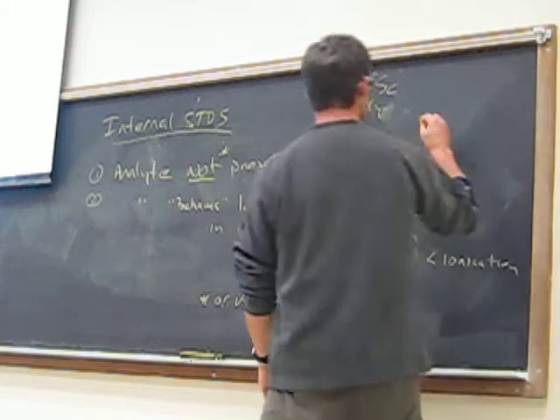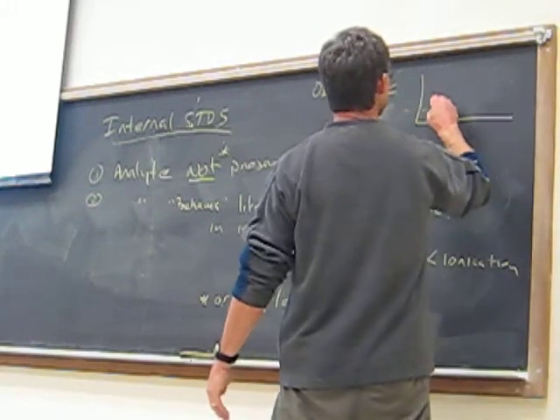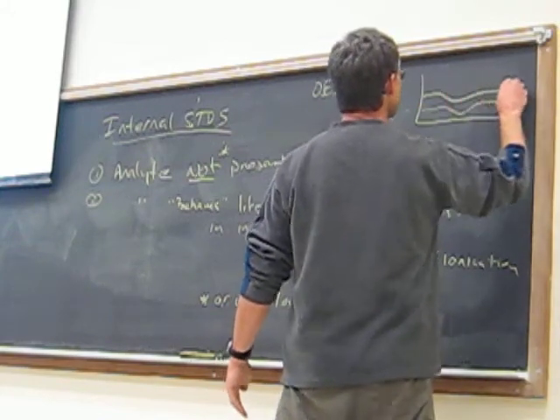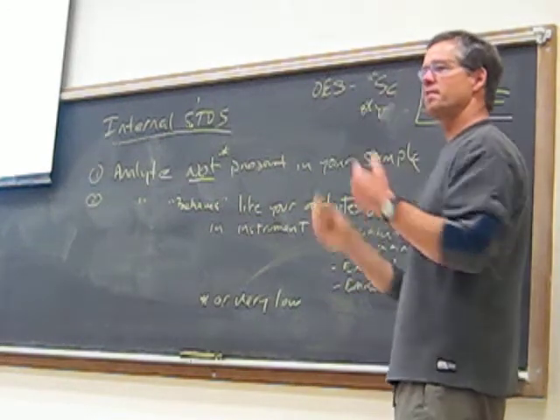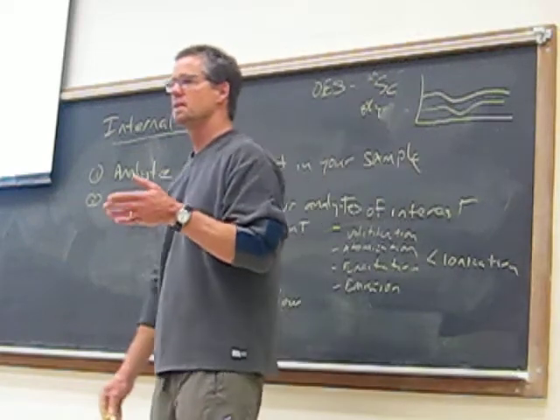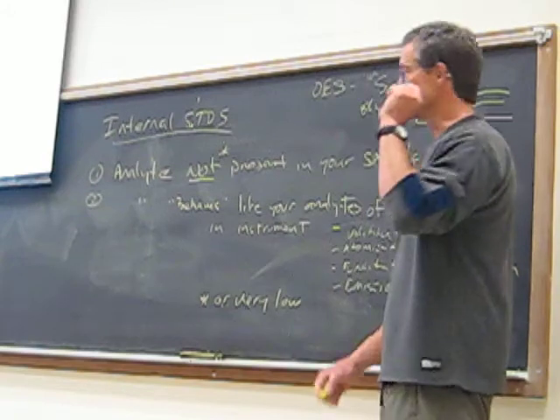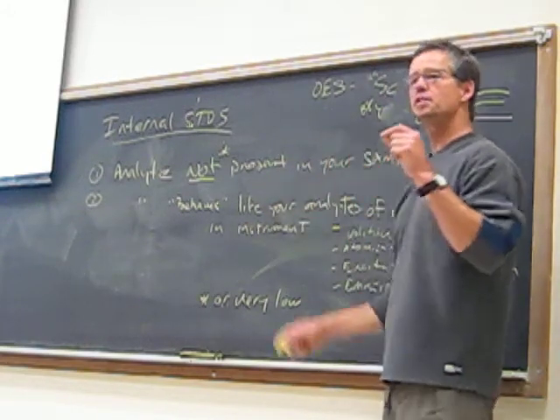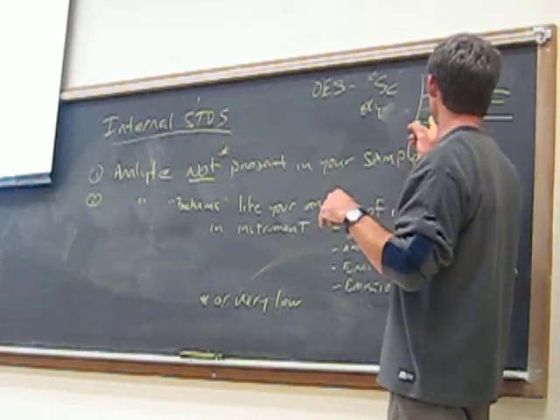And so I can have a signal, if I'm measuring these two things, where maybe it's going down, the matrix or whatever, and the scandium and yttrium is doing the same thing. If I normalize my sample to the internal standard, then I can correct for that effect. And it's an extraordinarily powerful approach because it allows me to skip doing the method of additions, assuming that these assumptions are met.